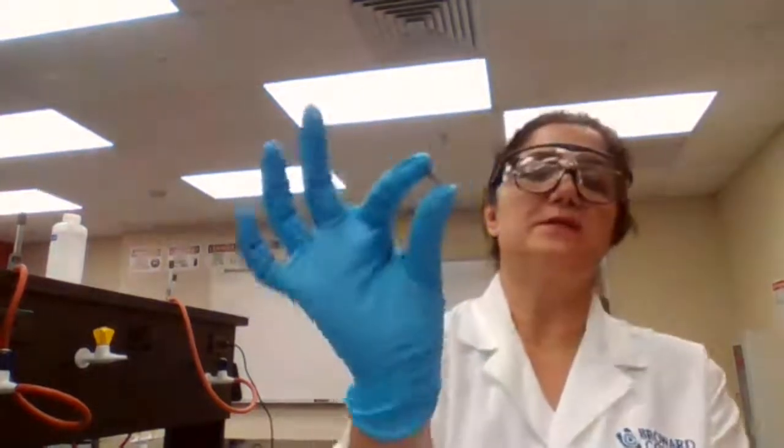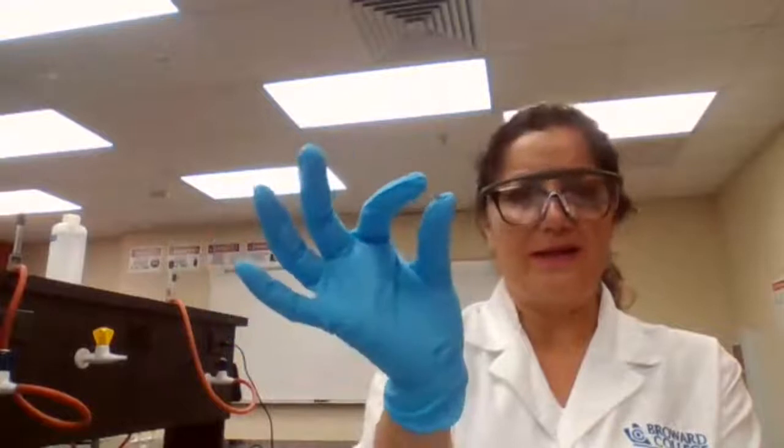Okay, second part of the experiment is the effect of concentration of the reactant. For that, we are going to take 5 pieces of magnesium. They're all about the same height. Magnesium is a reactive metal. It can react with hydrochloric acid at room temperature. So we are going to look at the time it takes to dissolve in HCl if we change the concentration of the HCl.